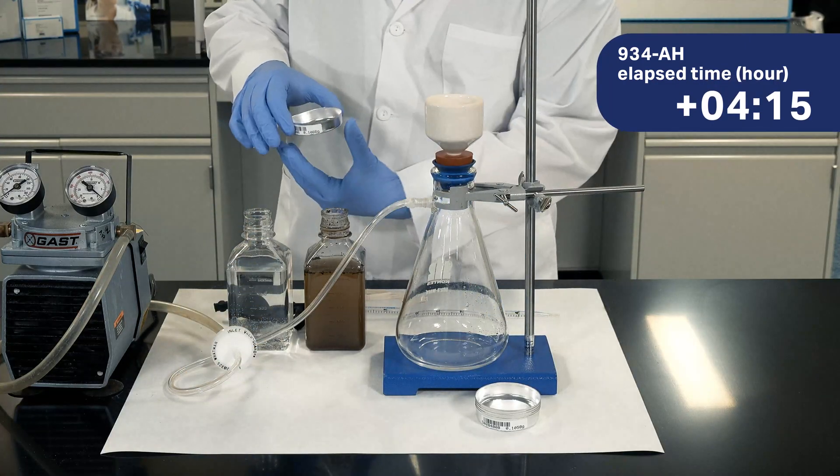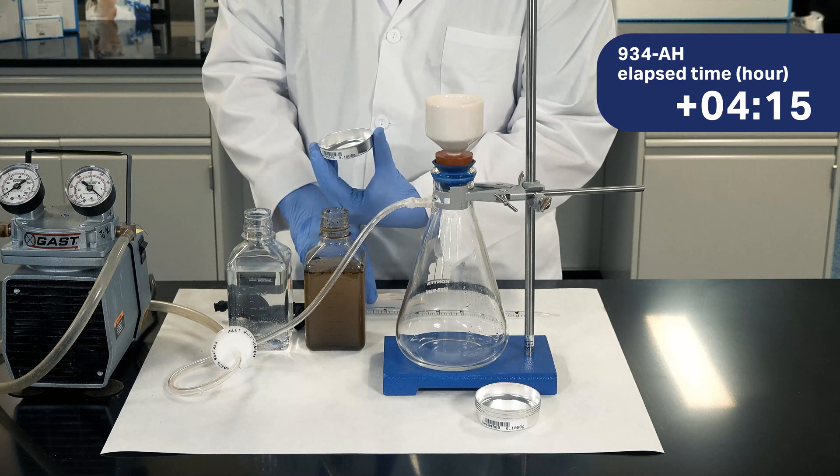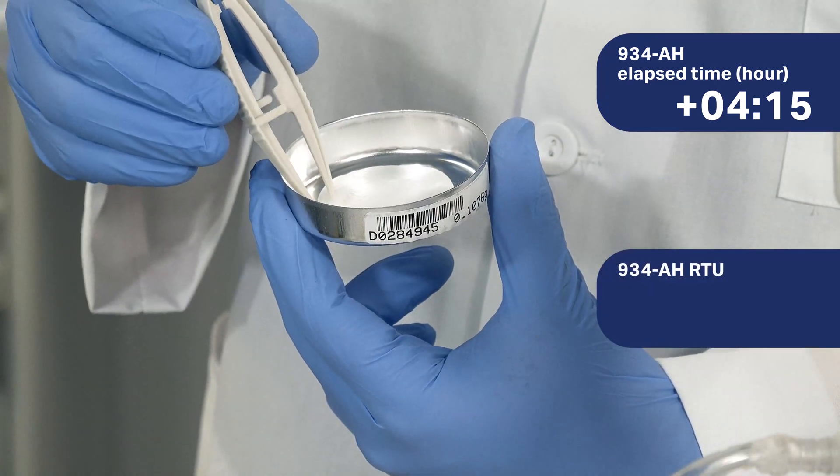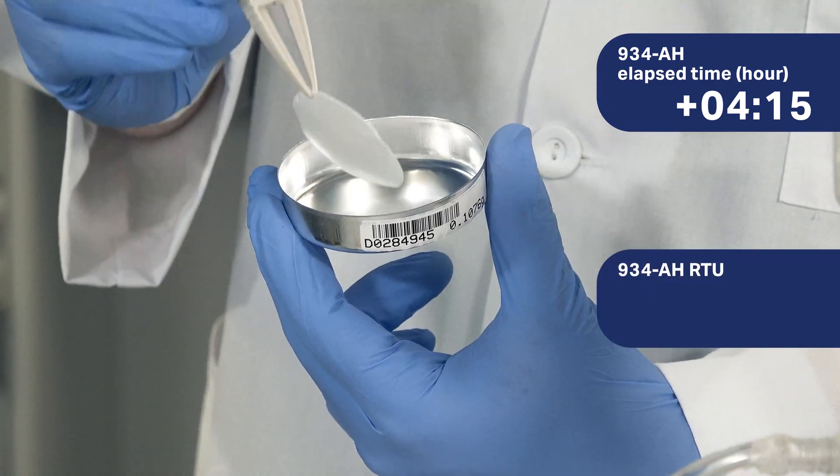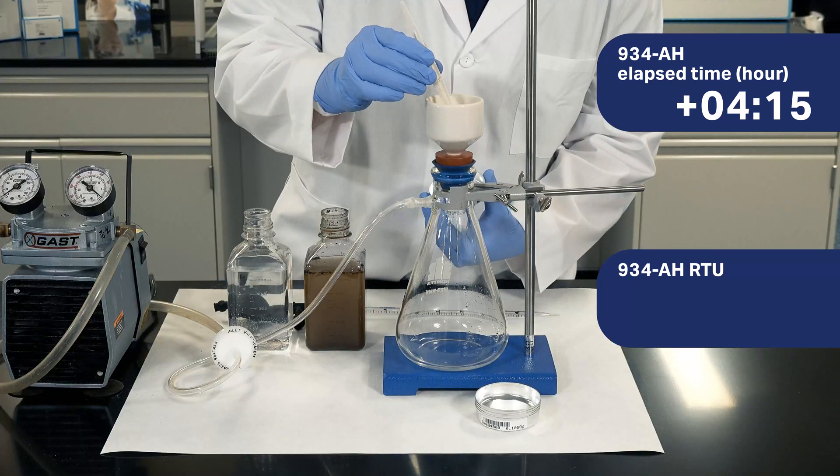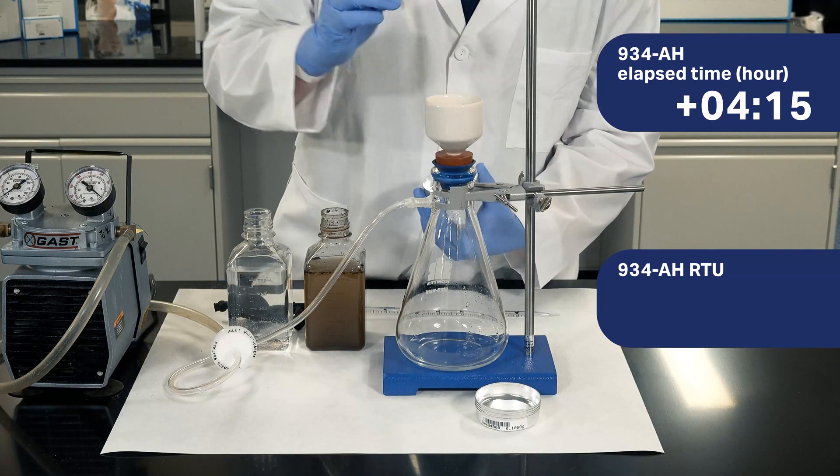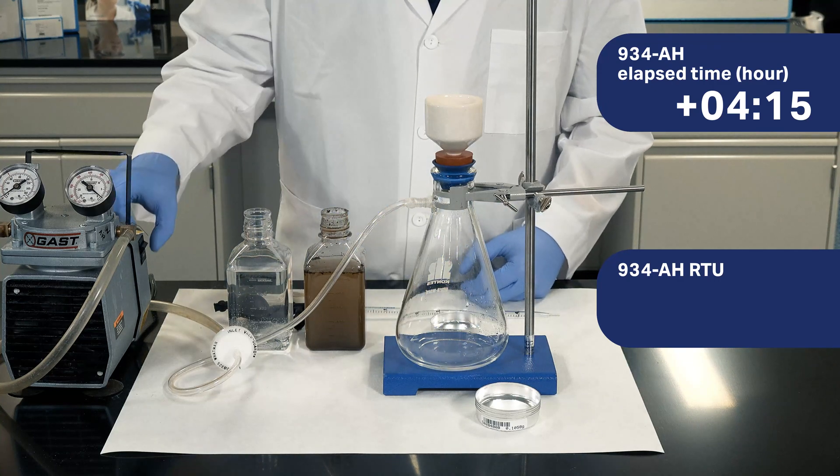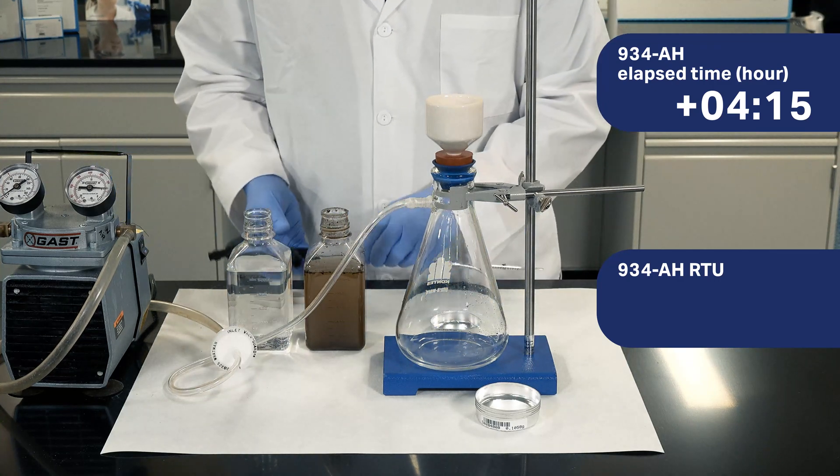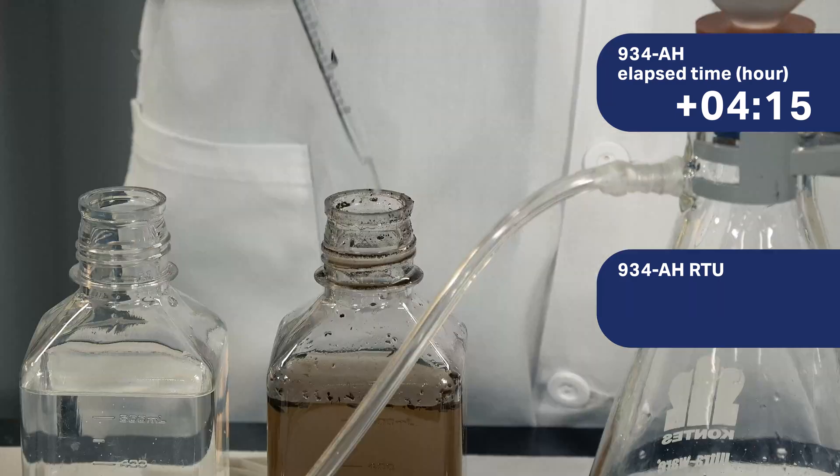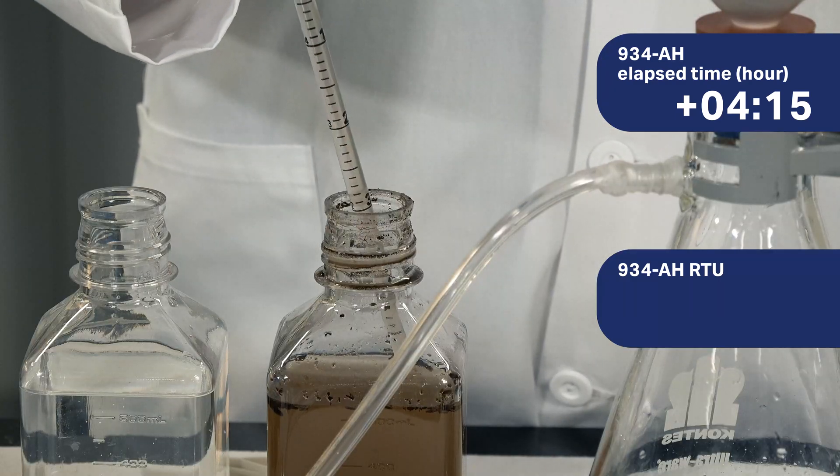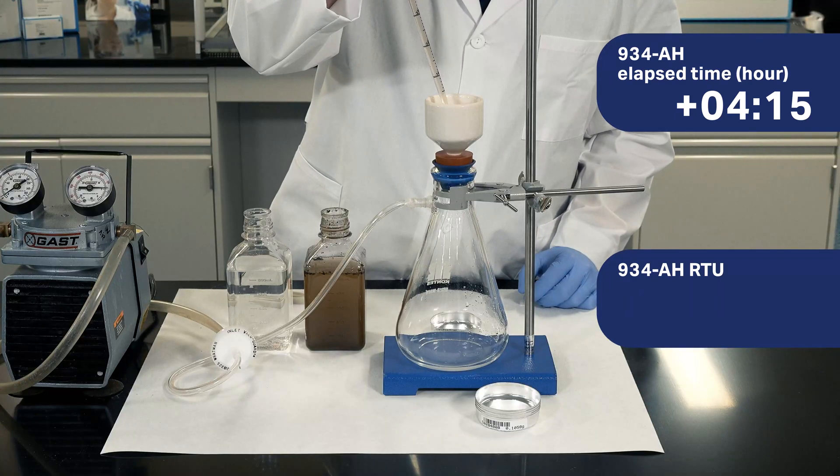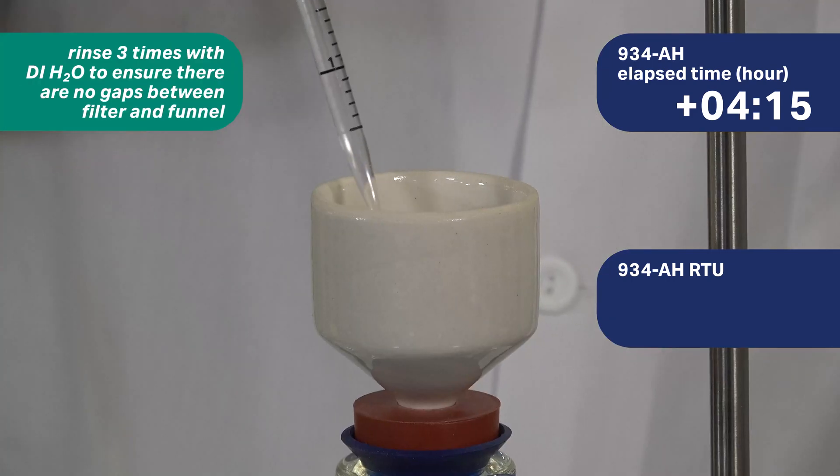At this point, the process continues for the 934AH and begins for the 934AHRTU. Record the mass of the 934AHRTU and seat the filter into the Buchner funnel. Filter a known aliquot of the desired analysis solution. Wash the filter three times.